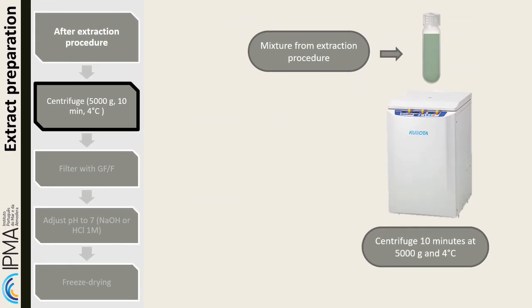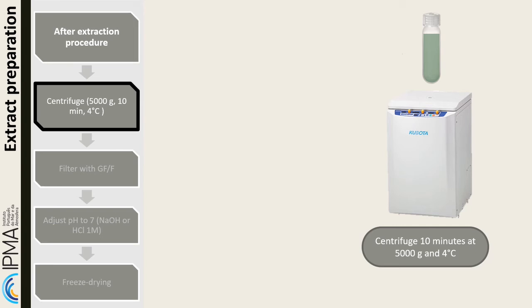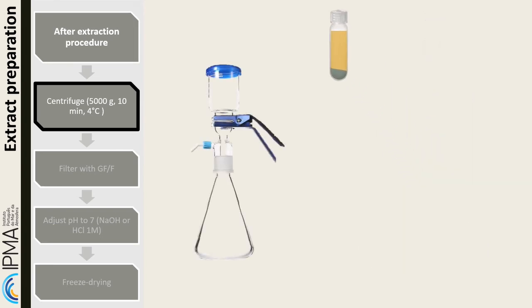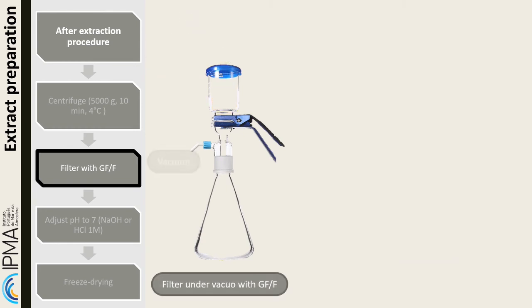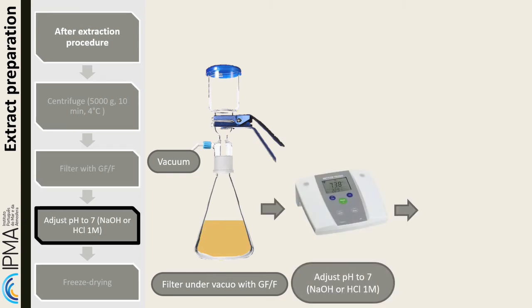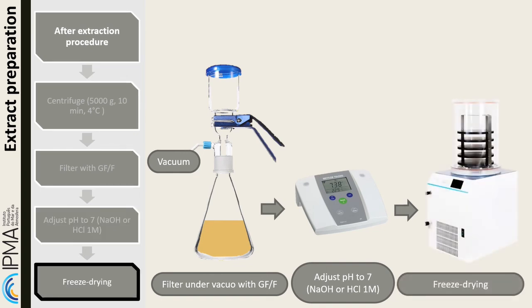For all the processes, the next step is to centrifuge the mixture at 5000 g for 10 minutes at 4 degrees Celsius. Filter the supernatant under vacuum with a glass fiber filter. Adjust the pH to 7 and freeze the solution at -80 degrees Celsius. Lastly, freeze dry the extracts.